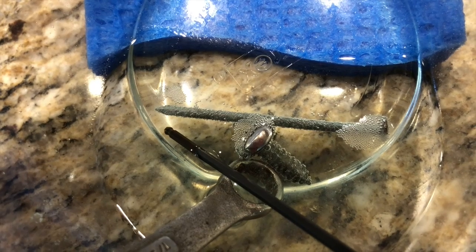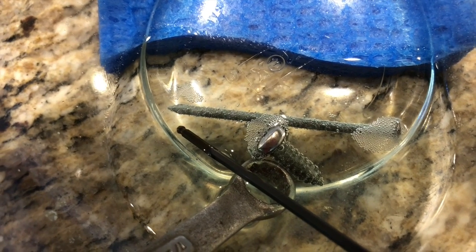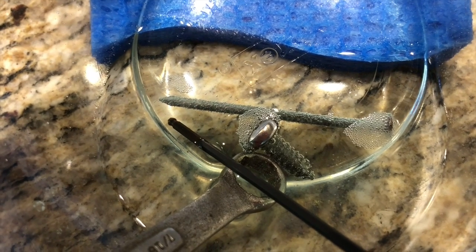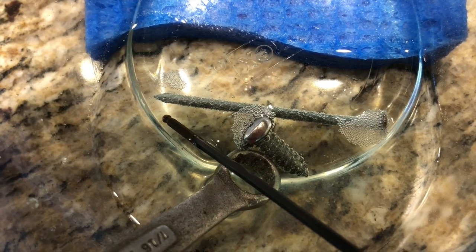This means that a similar case to the pennies occurred. The iron oxide broke up into iron and oxide ions, and that made space for the copper to plate it on the outside.